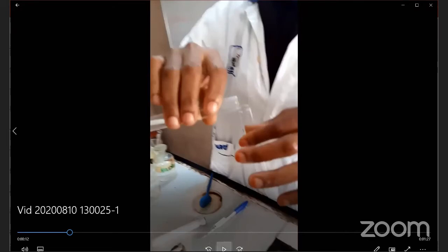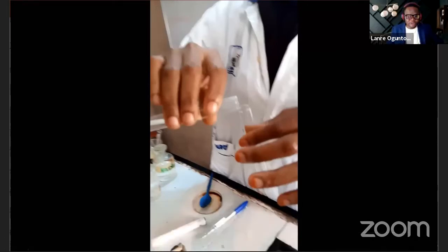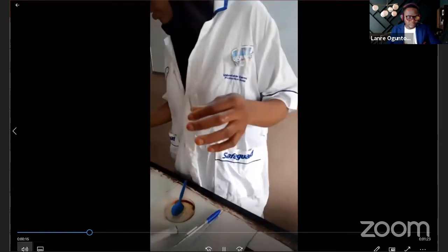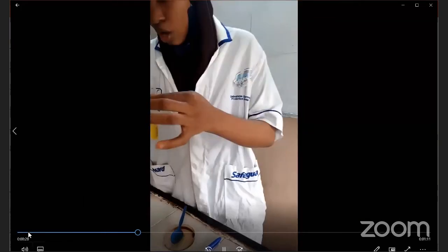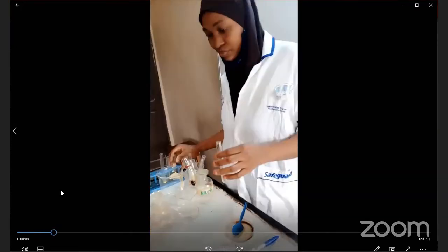So she's going to explain the oxidation of alcohol. From the oxidation, I'll now tell you the theory behind it. Let's listen and watch the change that we can see there. Adding to our test tube, then these are dichromates, potassium dichromate. So you add it. There's a color change that we are expected to see. We want to take an oxidation test for our sample C.